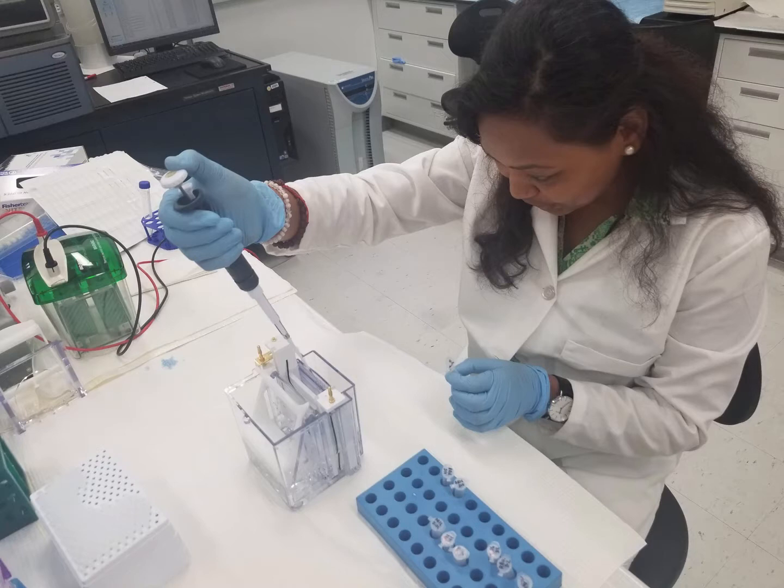I'm sure you know that when a charged molecule is placed in the electric field that exists between two electrodes immersed in the solution, it migrates toward one electrode or the other. Molecules with a net positive charge migrate towards the negative cathode, whereas those with a net negative charge move towards the positive anode, and this migration is called electrophoresis.